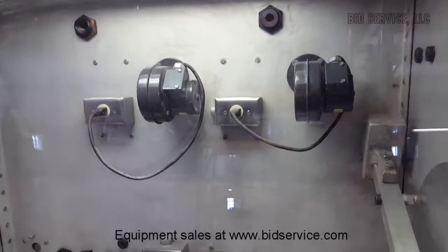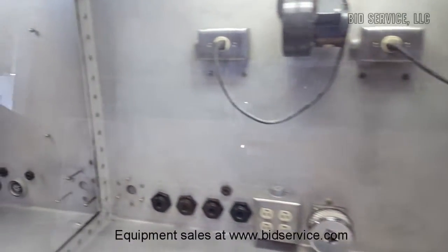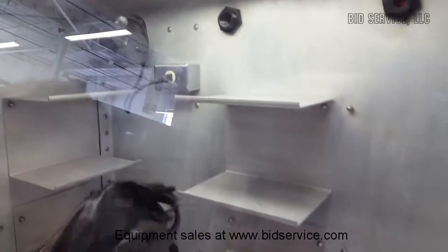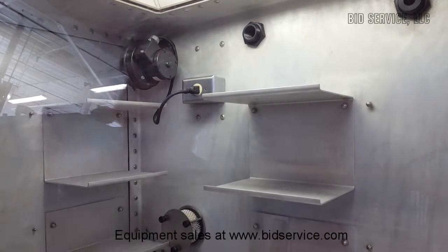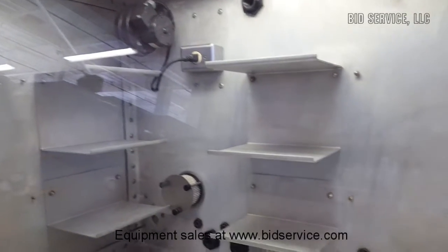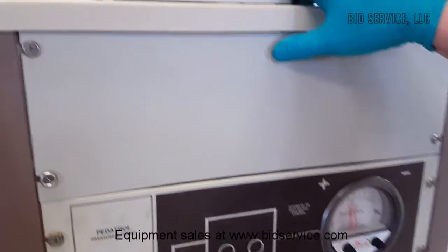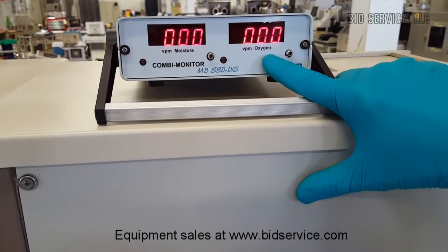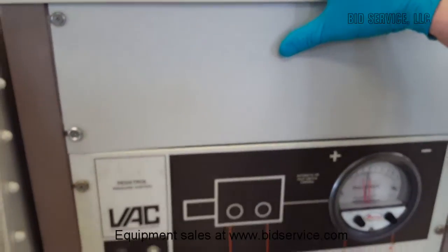Over here we have a 110 outlet, and on this side we have a blower that circulates through the filter material and purifier media, then out through this filter — it's plugged in up there. Right now we're at less than one part per million oxygen. I'll introduce a little oxygen later and you'll see the purifiers are taking it out.